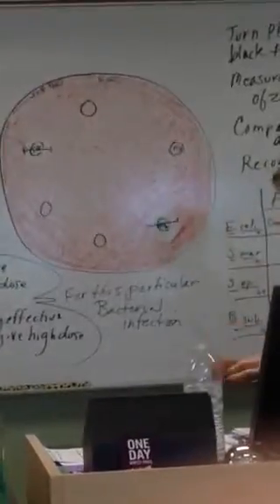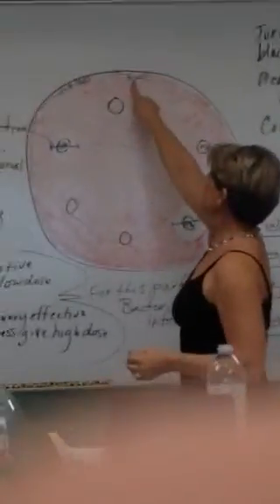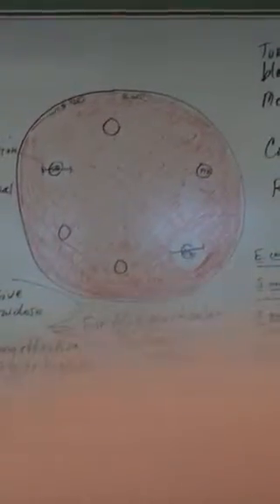Okay. Now, you're going to put your Petri plate upside down. This is my plate for E. coli, so it's covered with E. coli, which is essentially a bacterial lawn. The entire thing's covered with E. coli. And then I dispense my antibiotic discs onto it. And each disc is labeled with the antibiotic. I just didn't label those.